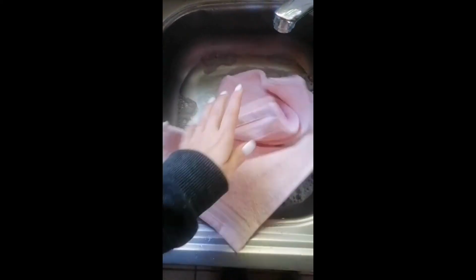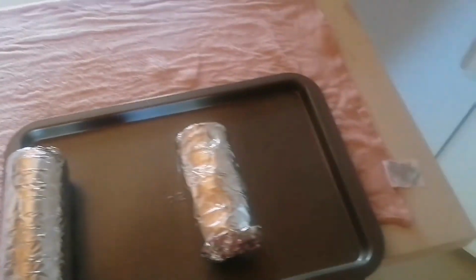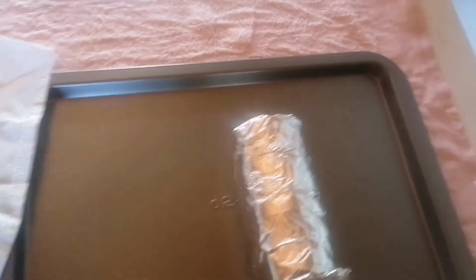After that, I will prepare our still air box. So here I have some soapy warm water. I will add my towel in there, let it soak it up a bit, and then I'll wring it out. So here we have the soapy towel on a table, and now I am moving the petri dishes. They are extremely hot, so please be careful when you move them out of the oven. Do not burn yourself. Yes, my hands are still full of soap.